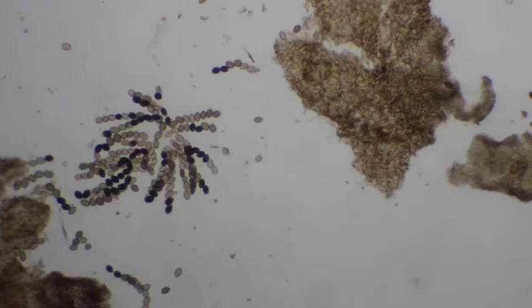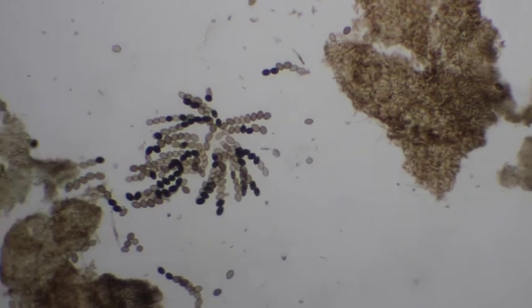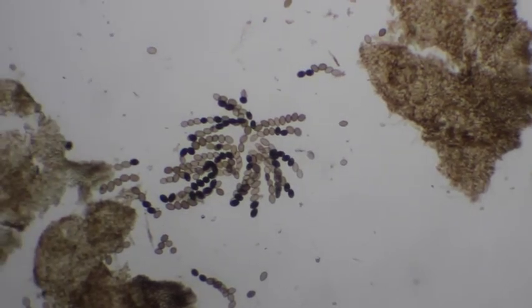So here's a good one. You can see that it's not fully gotten its color yet. We can see kind of a 2, 2, 2, 2 arrangement there. Okay, here's another one. Let's see what we have here.